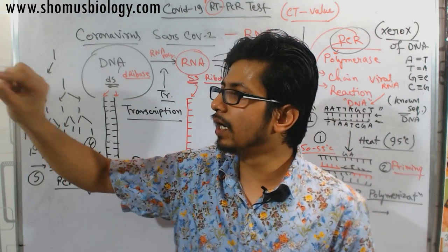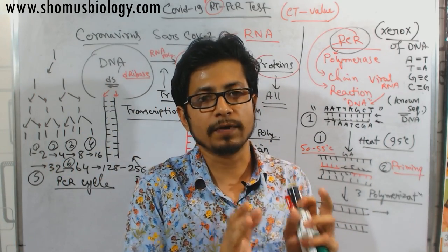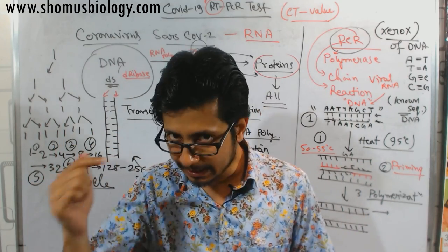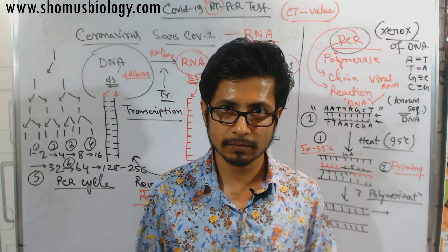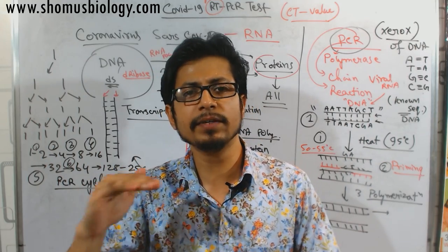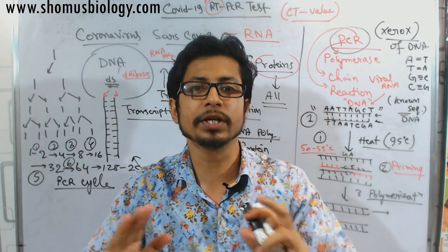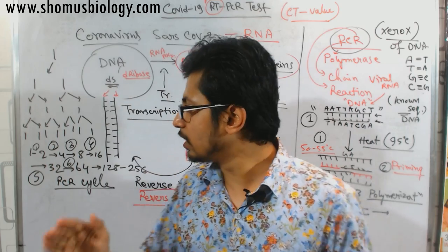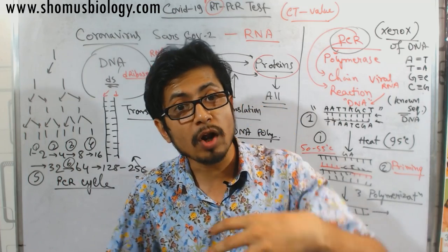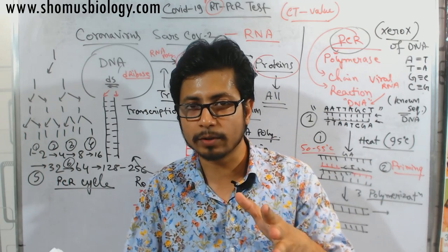We made a level, meaning a particular concentration of this viral genetic material. Once this level is reached, we call it a serious infection, and in our case the level is set to 35. So if someone has a CT value of less than 35, that means the person is COVID positive, because in case of Ram, as I said, 20 cycles are needed. That means Ram already had a higher load of virus in his body, right? Try to understand, try to correlate.